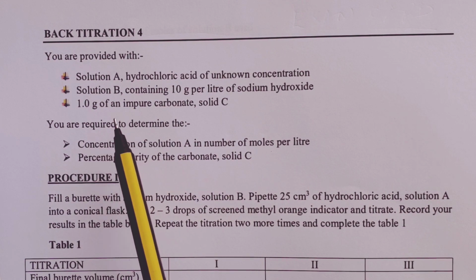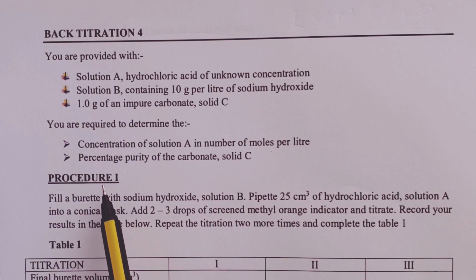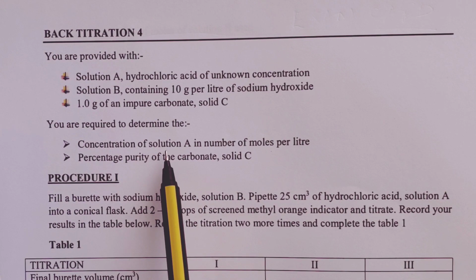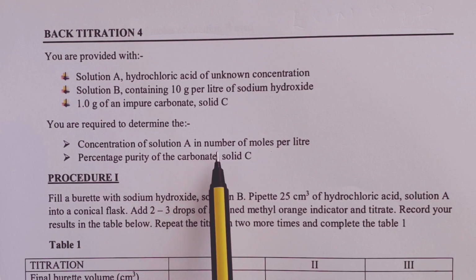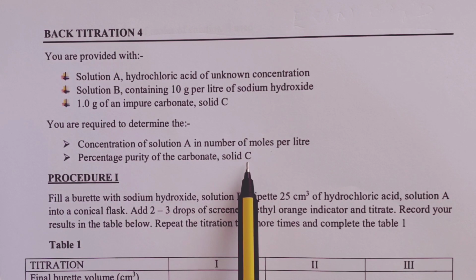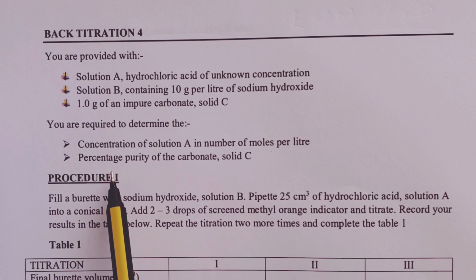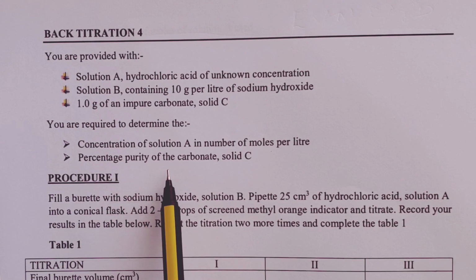So in this experiment, we are required to determine the concentration of solution A in moles per liter in our procedure number 1, and then later on in procedure 2, we shall be required to determine the percentage purity of our solid C, the carbonate.